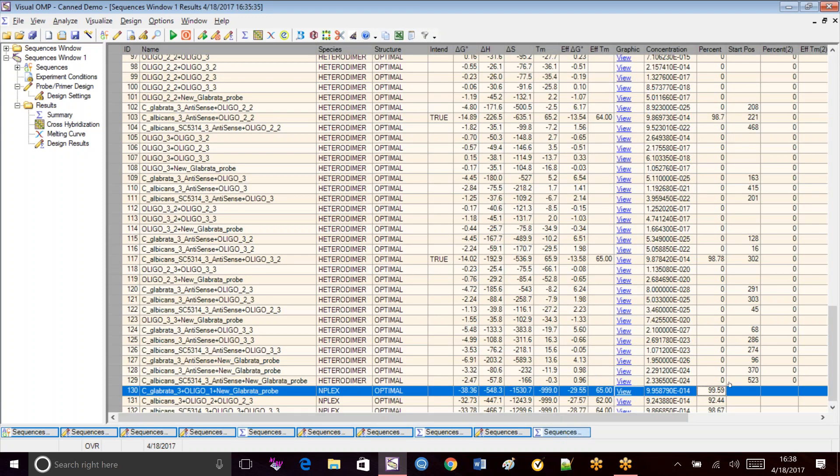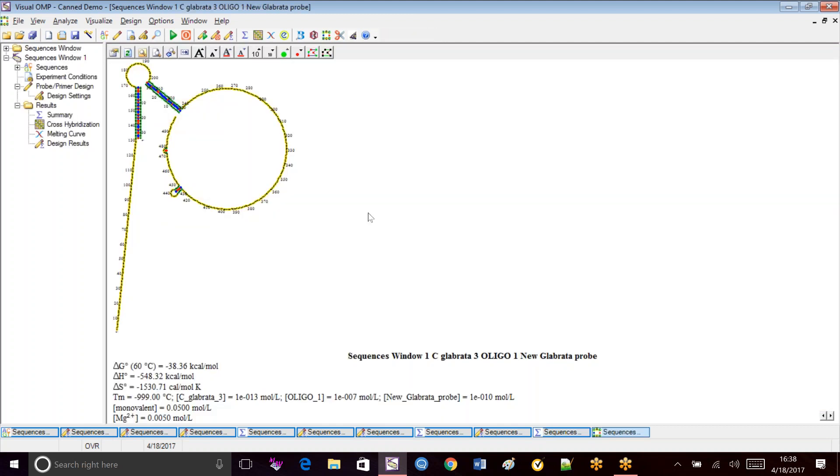So again, we see using this strategy, we were able to raise the percent balance for our Glibrata to 99.59%. So again, we can look at the structure. It looks like it's in about the same place. It just made it longer. So that's how you optimize VisualOmp designed multiplex primers and probes in VisualOmp.